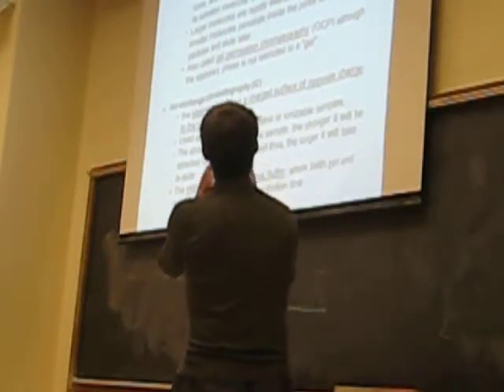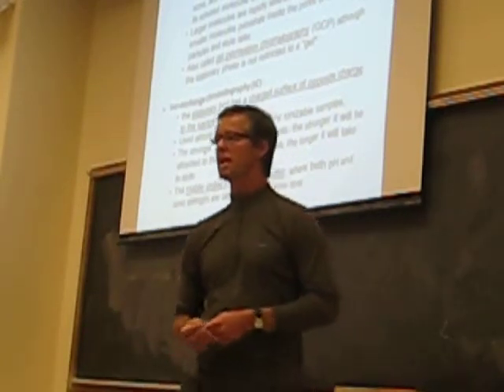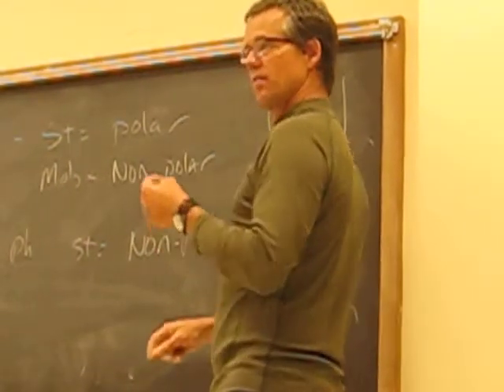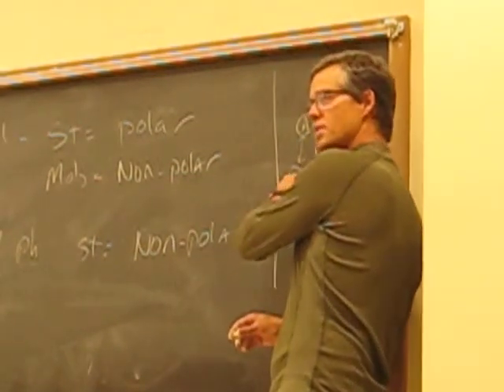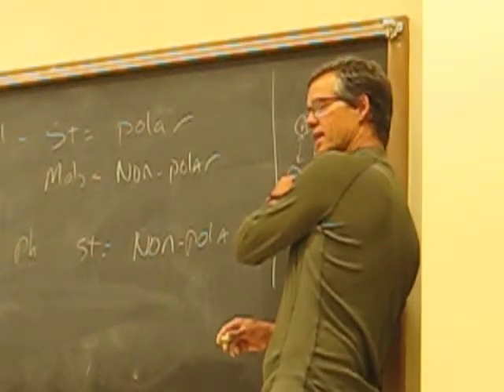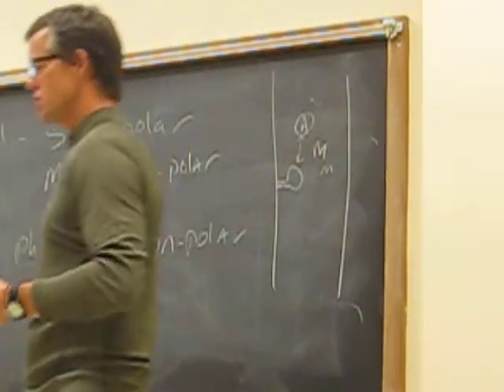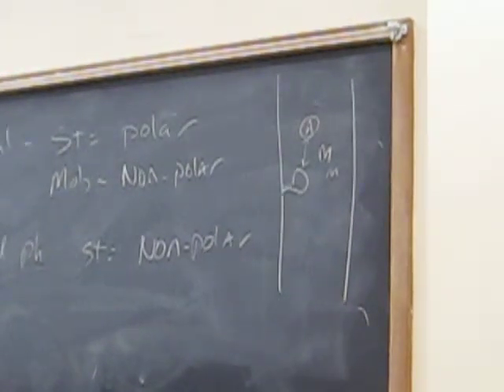Okay. And then ion chromatography, of course, you know all about that, right? That is essentially looking at how ions, and you're doing anion exchange, because you're exchanging the anion, which is your analyte, with the stationary phase. Of course, if we wanted to separate cations, it would be the exact opposite. The stationary phase would not be quaternary ammonia, it would be some anionic species, right? And your analyte would be cation. And ion exchange is just being facilitated by the electrostatic interactions and partitioning between the analyte and the stationary phase.